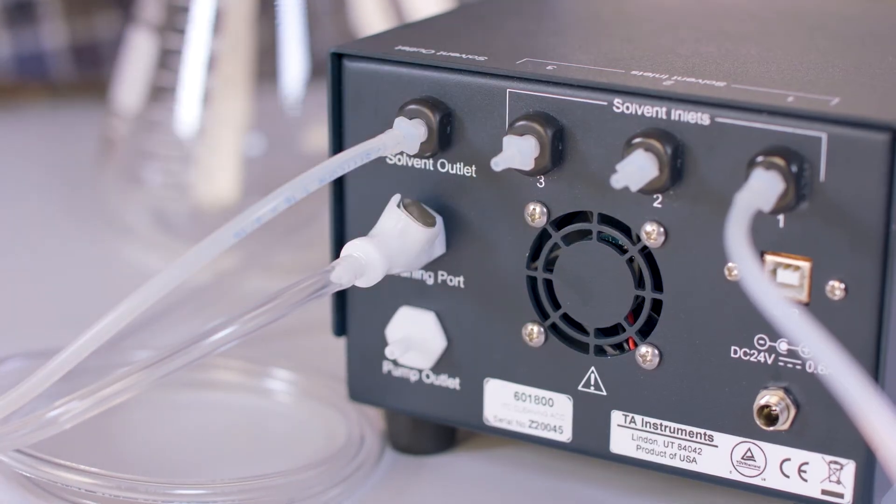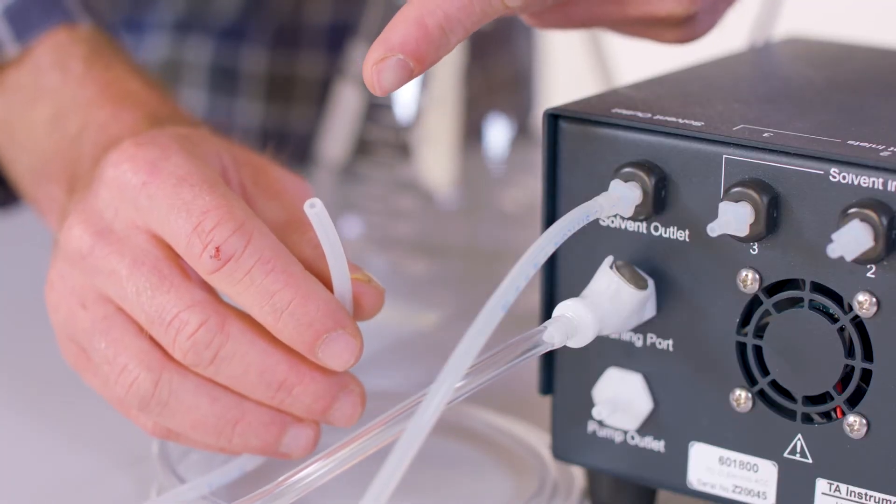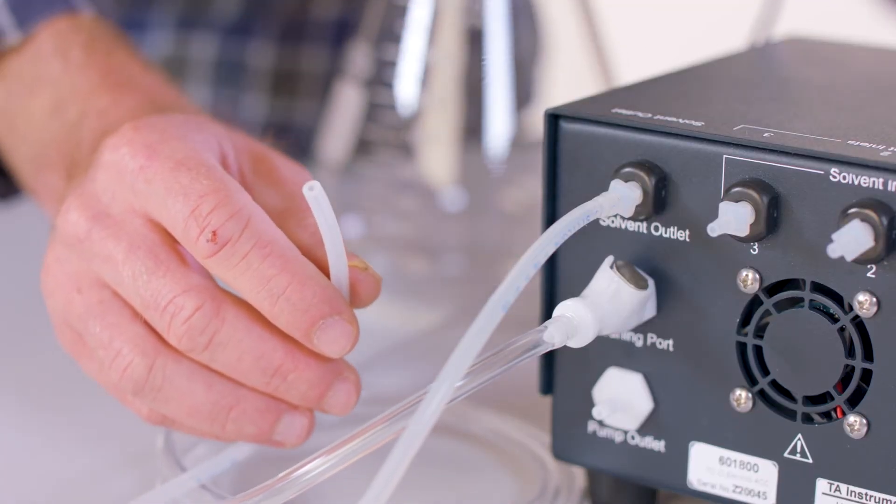An additional tube is then connected to the solvent outlet. At this point, the tubing can be connected from the solvent outlet to the calorimeter.